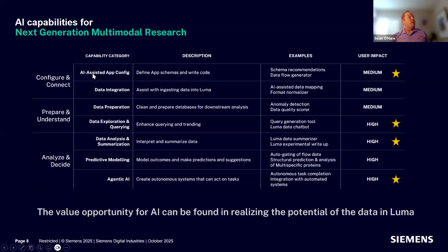So in the case of Agent Luma, and you've all probably seen this in the news, it has the ability to basically program itself. So we can ask it, I'd like to write an app. Here's a base file that represents the data model. These are my objectives for this app. And it can talk through it with you, and it can actually operate on its own machinery to build out the data model, build out data flows, and get you either all the way or most of the way down the road to an actual application.